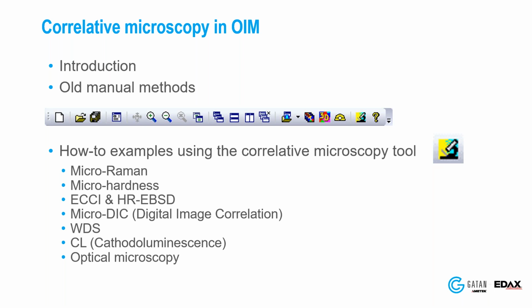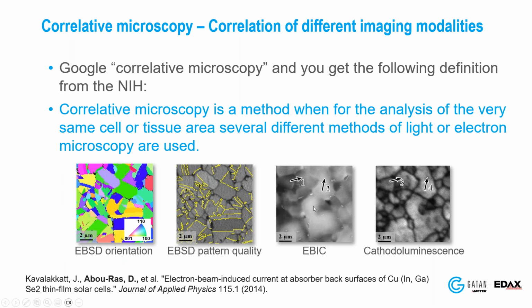I'll have examples from micro-Raman, micro-hardness, ECCI, DIC, WDS, cathodoluminescence, optical light microscopy, and a couple of other examples.